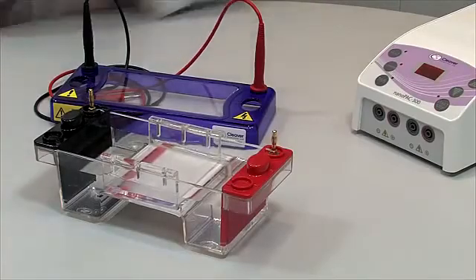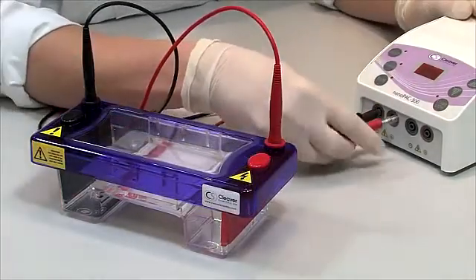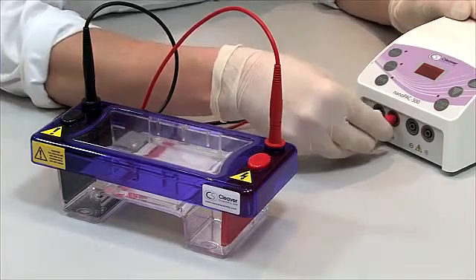Remove the comb and replace the lid, taking note that samples are migrating to the red positive electrode.